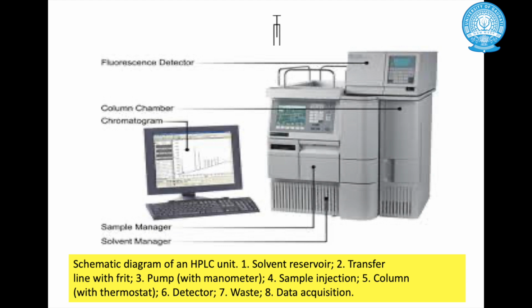So this elution pattern is shown here in a chromatogram, which is taken from a published paper, wherein sesamol, sesamin and sesamolin, which are compounds present in sesame seed oil. Here the sesamol with OH, which is polar, is eluted faster, and after this other compounds which are less polar are eluted.